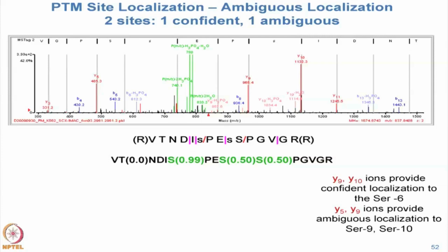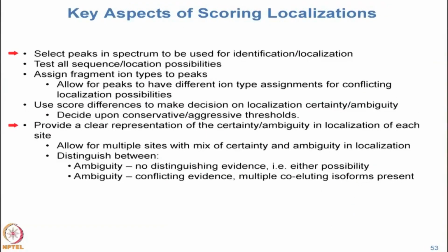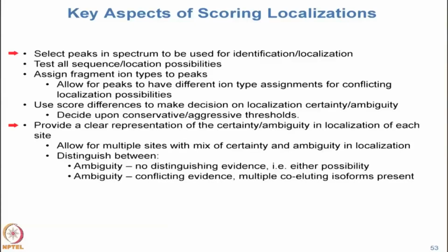Okay? All right. So I tried to show you graphically, when you look at the spectrum, whether you have the information. If you're going to write a program to do this, these are some of the things that you have to put into the design of your experiment. You're going to think about all of these things. I think the most important of those things are shown here.